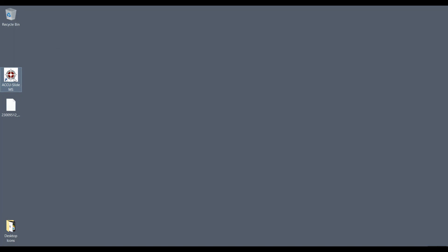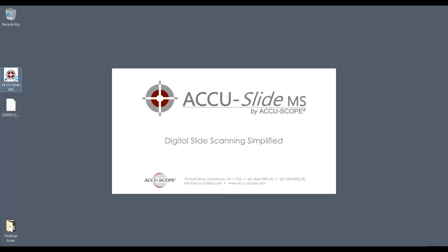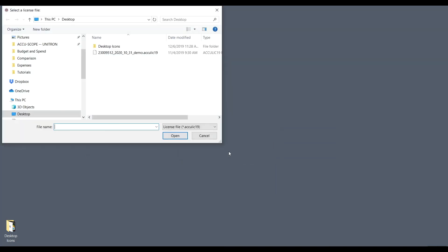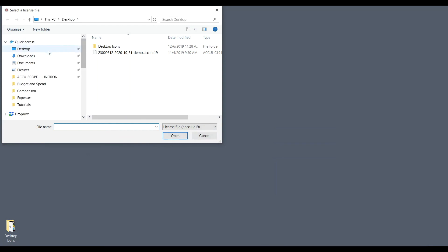Launch AccuSlide MS. When asked, navigate to and select the license file. Then click open. Note that the first seven numbers of the license code file name correspond to the serial number on your camera.